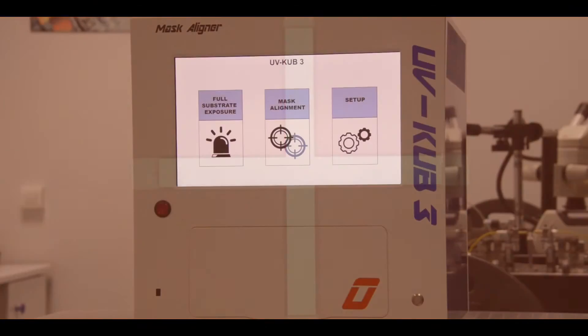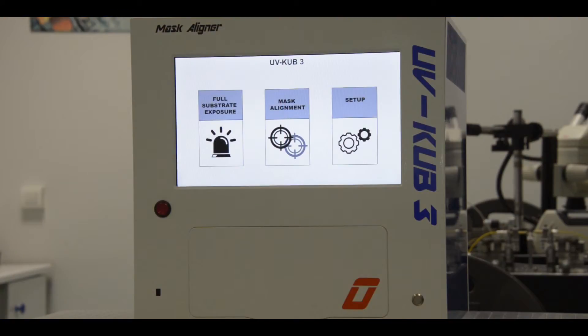Dynamic and intuitive, the UV-KUB 3 is a high-precision machine compatible with all photosensitive resins used in your microfabrication work.